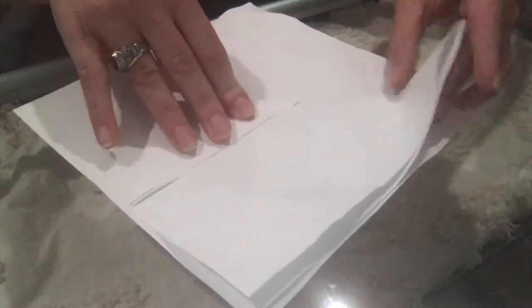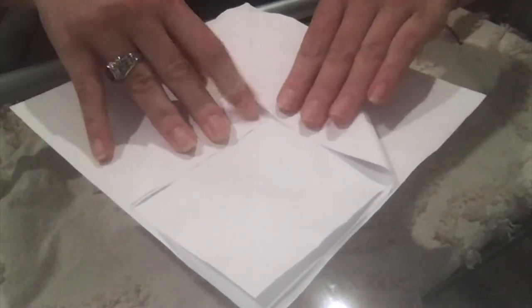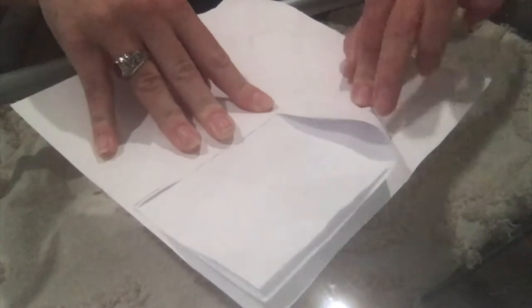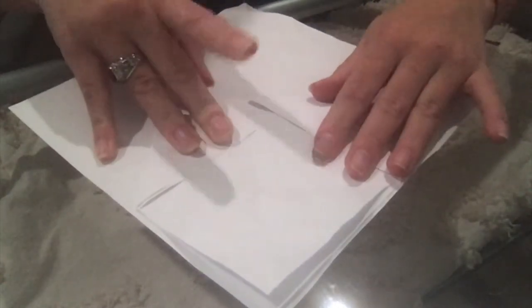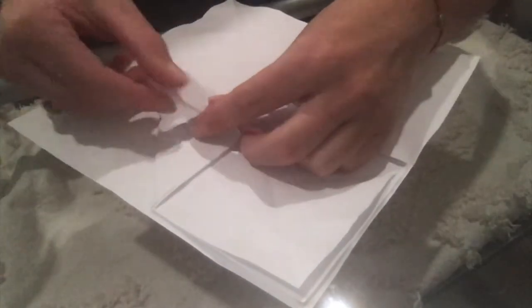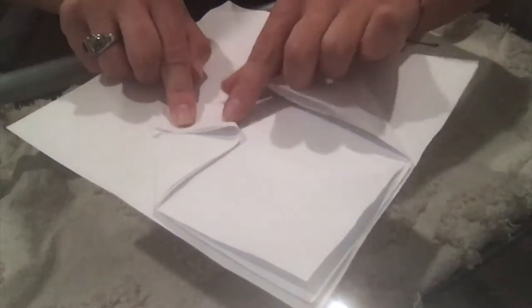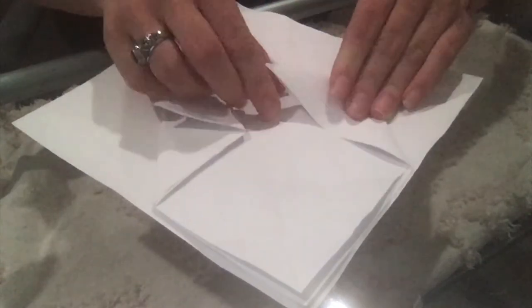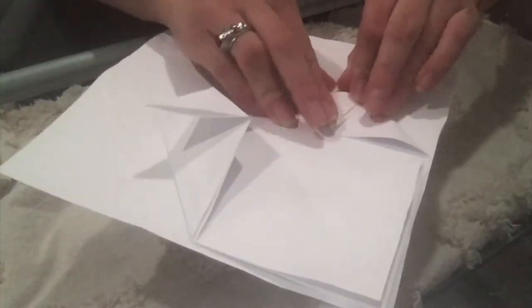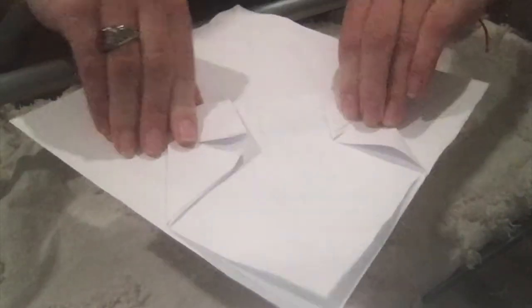Do the same thing on the other side. Try to make sure the fold on the bottom is about a 90-degree angle. Then we're going to do what my teacher calls the 'doggie earrings,' which is basically like a little door — you fold that corner of the triangle in. This will be important for when you open the paper after the object is sterilized.